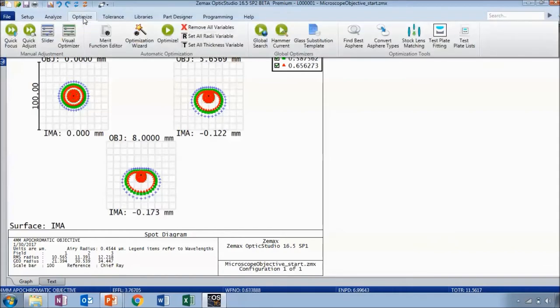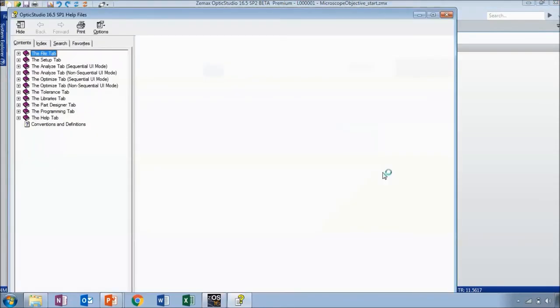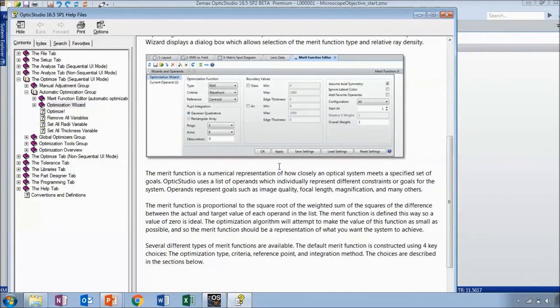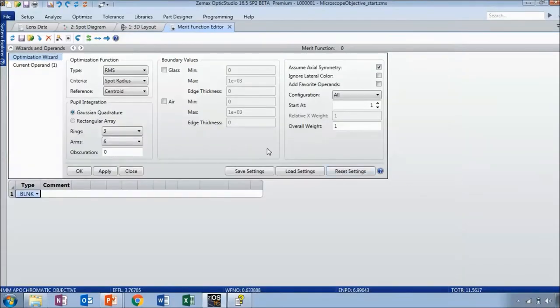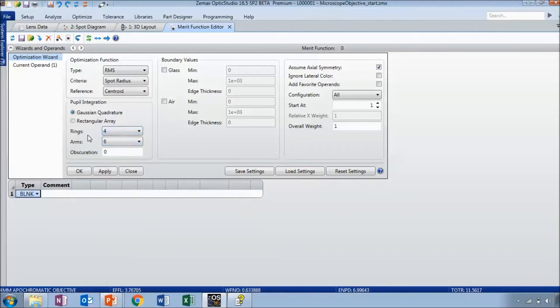OpticStudio has a more sophisticated way to optimize and automatically find the best values for all of these parameters. Let's go to the optimize tab and open up the optimization wizard. I'm going to optimize for the smallest spot size, changing my criteria to spot radius. I won't explain all the settings here, but if you want more information just click the blue question mark to open the help files, which includes definitions for all of these settings.